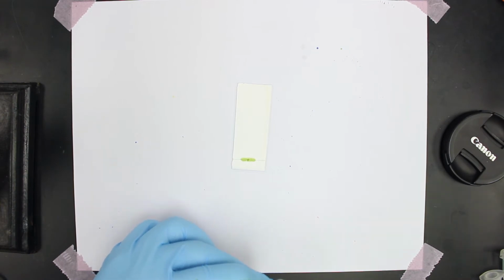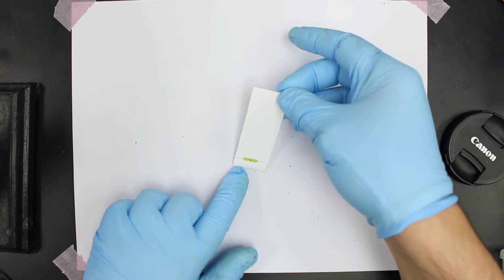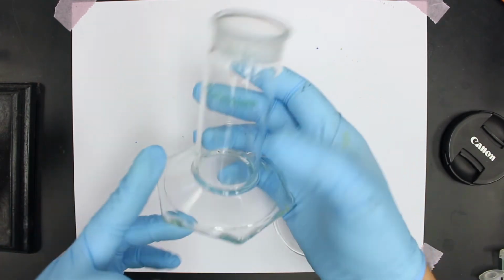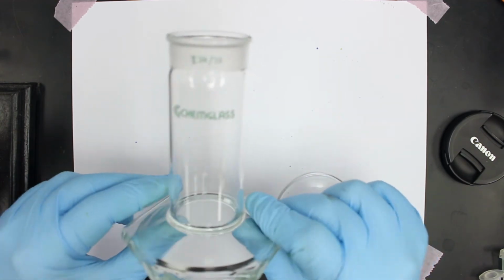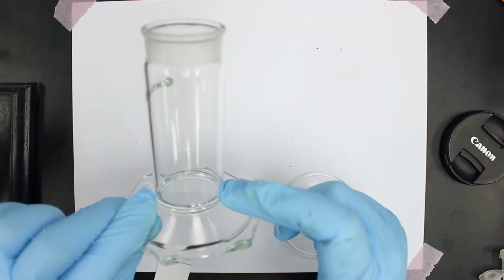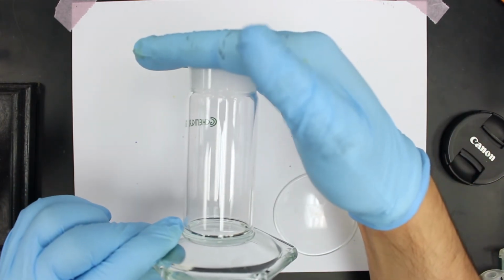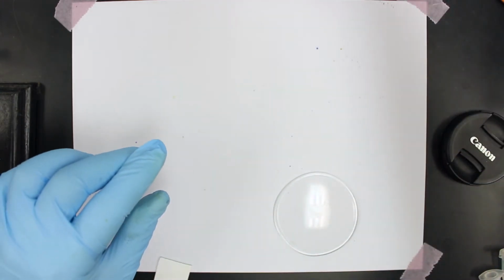So now that we have our plate, which we have created, we've applied our sample. Now we're going to place it into our developing chamber. Our developing chamber is right here. This is one of the purpose-built TLC chambers, which is meant for doing it, but you could do it in a beaker, which is much cheaper. This runs about $200. So what you do is you fill this up with a few millimeters of your mobile phase, and then you stick your plate into here, and then you cover the top, and then it'll take a few minutes for the solvent to run up the plate. So let's go see what that looks like.